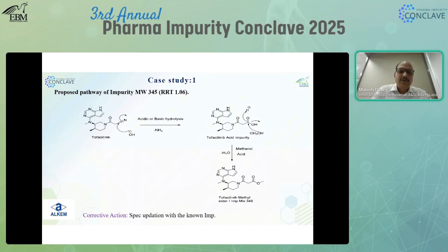Then we went for synthesis, synthesized this impurity, and confirmed by spiking in the HPLC analysis that the RT is matching. Again we performed the LC-MS, and once we knew that this is the only impurity degraded in the post degradation, we performed the validation activity. This unknown impurity was made known, and this methyl ester became part of the specification.